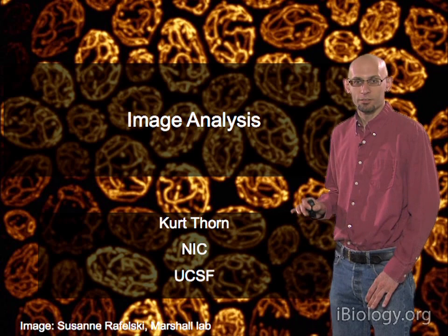And I just want to touch on this in a little bit of detail. This is, again, another large area of image processing, of binary image processing. But I'm just going to mention a few very common techniques here. The 2 common techniques are erosion and dilation. Superficially, these look a little bit like the filtering approaches we had before. We have a kernel here. It's now called a structuring element.